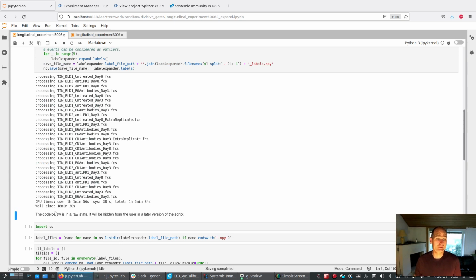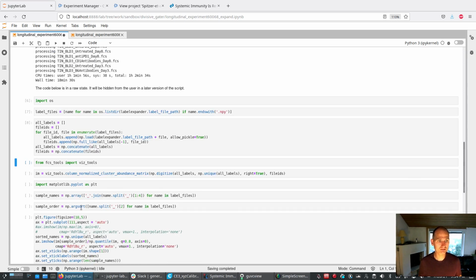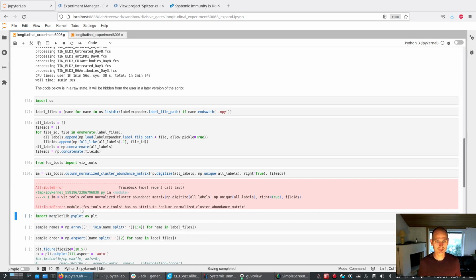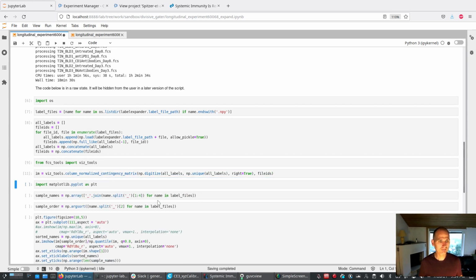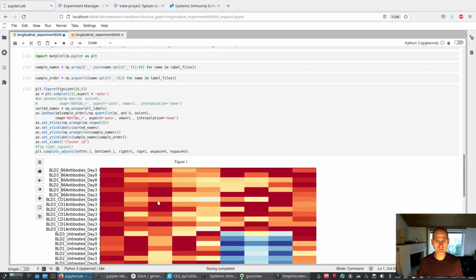So 20 minutes later, it's done, and now I'm curious to see what has happened. It's a little bit exciting. Did we manage to get a nice separation, or is this just, I don't know, what am I doing here? Oh, I have changed my script, so now it's not called something like this. It's called something else. Yeah, so just a little small detail.